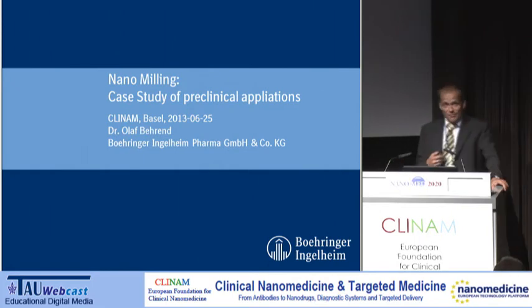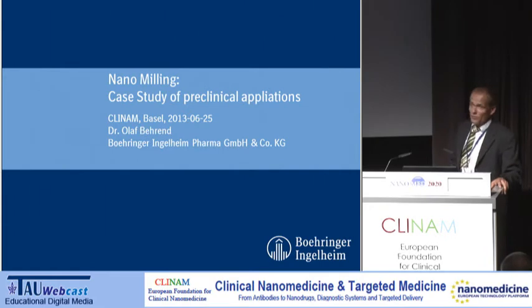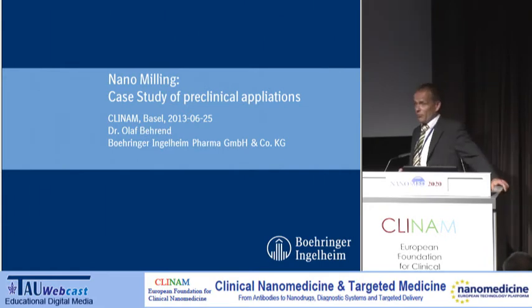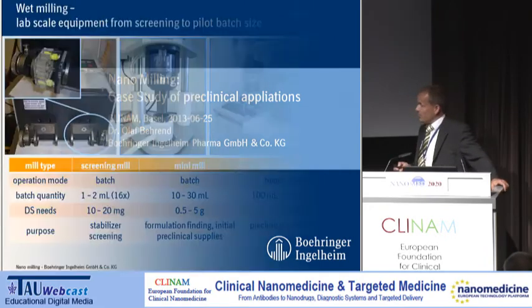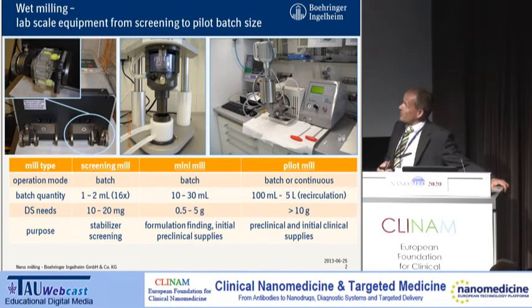So this is probably much different to many presentations you would see here, where it's more a bottom-up approach, like liposomes and things like this. And here we have the top-down approach to really comminute the particles to improve the performance of such materials. I'm going to start by simply presenting some pictures of typical, here lab-scale equipment we use in the early stage of formulation development.